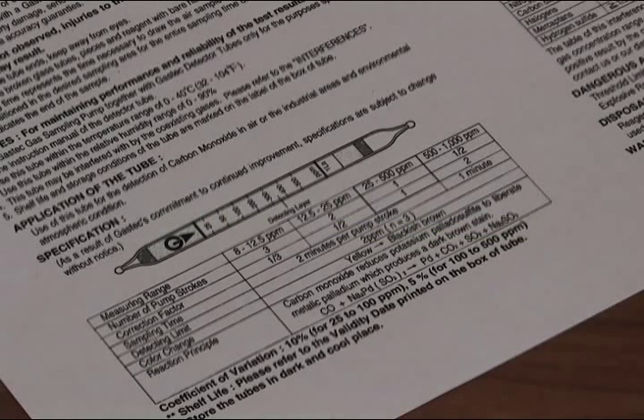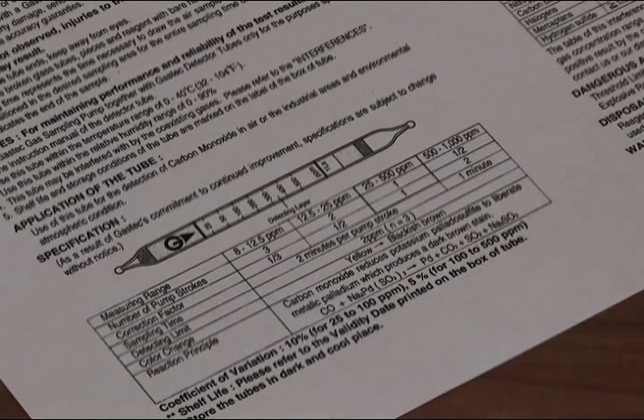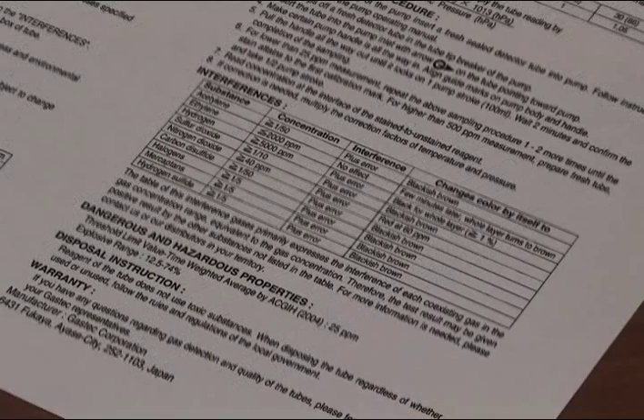Depending upon the contaminant tube you're using and the result you get after one stroke, you may need to retake the sample — either with a half stroke if the concentration is low, or with two strokes if the concentration is high. Refer to the instructions to find out what correction factors you need to apply to the sample. The instructions also tell you about potential interferences.